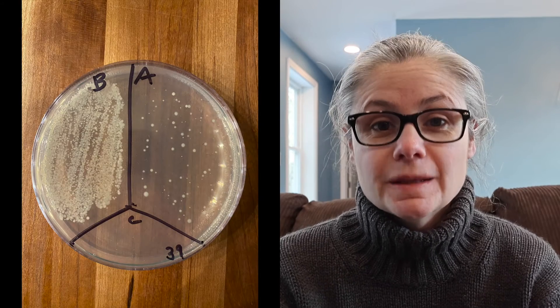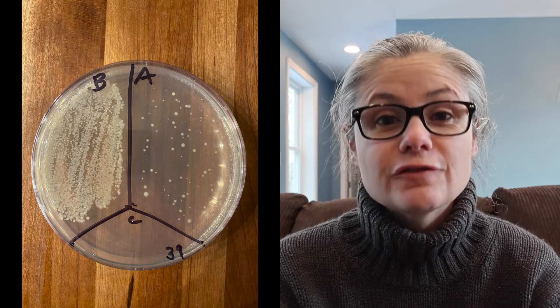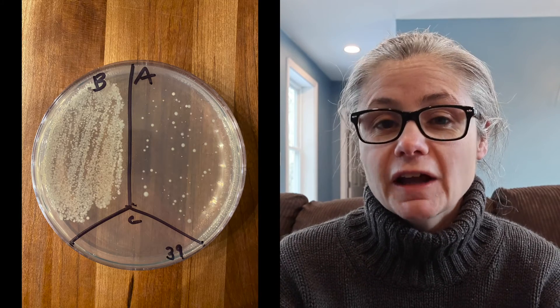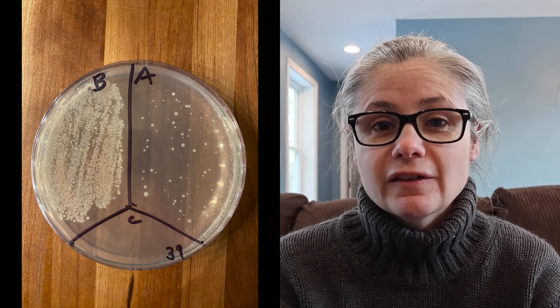The first sample: in the before section we can see a lot of bacteria — that's a good sampling. In the after section we can see a visible decrease in bacteria. There is still some bacteria hanging around, but there most certainly is a visible decrease. So the Snowbowl did a pretty good job at removing bacteria from my toilet bowl.